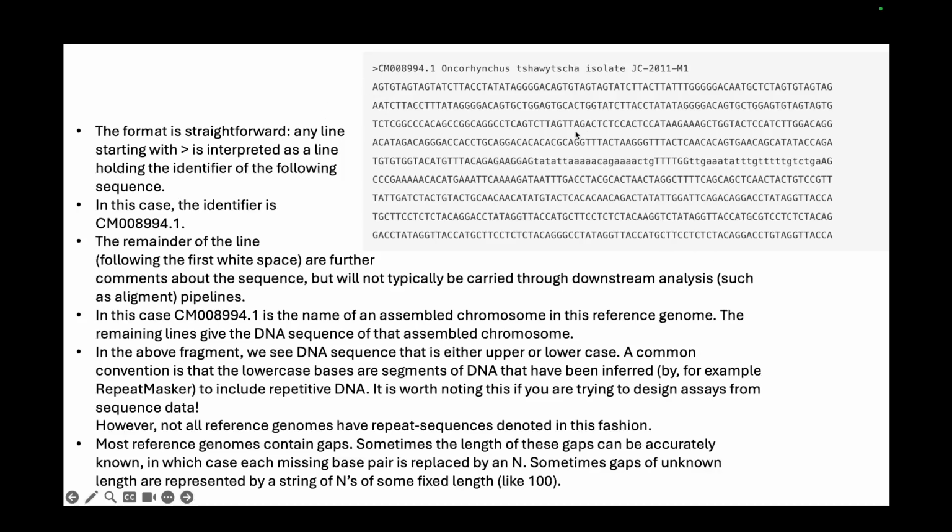But one thing you'll notice here is that this is a DNA sequence with ATGC, and most of the letters are capital, but in the middle, in some cases, they are small. What this is doing is a concept called masking. If a portion of the DNA sequence falls inside a repetitive region, that portion is masked to represent that it is a repetitive region. So instead of capital letters, they are written in small letters. This is called soft masking.